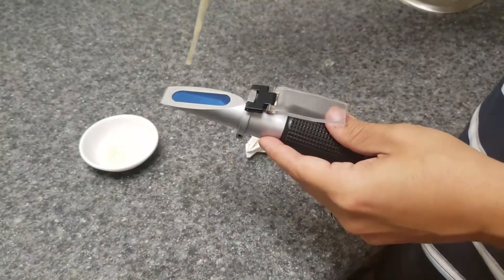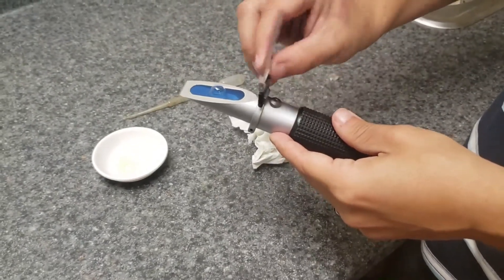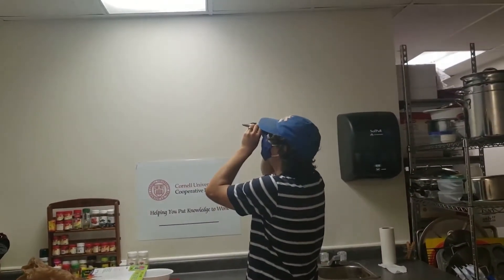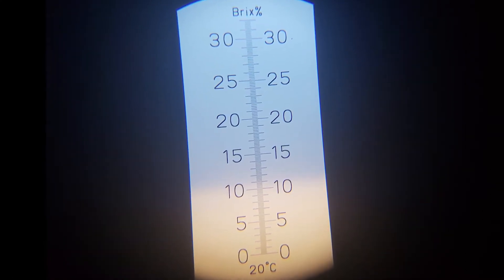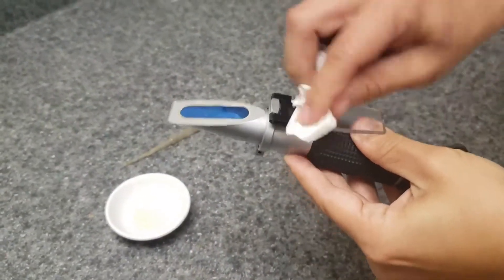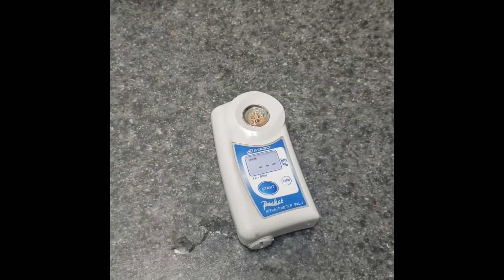To measure Brix, you will use the juice you collected from the apples as you measured pressure. Place a few drops of juice onto the prism of the refractometer and cover the slide. Look into the refractometer while holding it up towards a light source. This reading is measured from the top of the line where the light and dark colors meet. Record the reading to the nearest tenth. Rinse the refractometer's surface with water and dry between each use. If you are using a digital refractometer, the device will give you a reading with the push of a button.